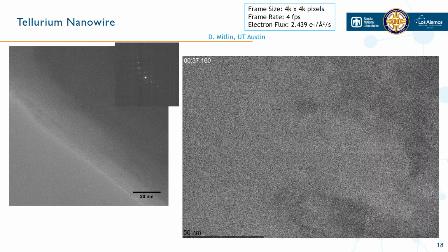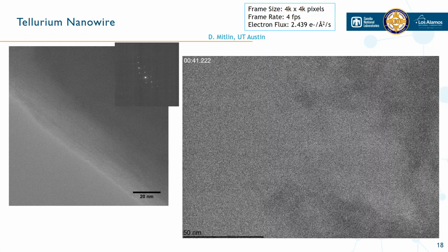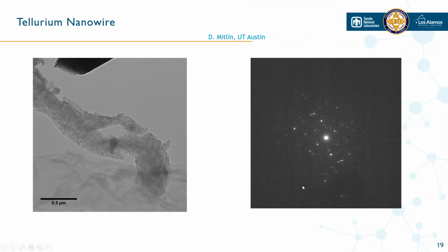But we can go to the next slide. We know that it did change from a single crystal into a different crystalline structure. So next slide. That's also shown in a large morphology change of the nanowire, where before it looked like a nice single crystalline structure, and then here it's all bent and it looks like many particles within that structure.